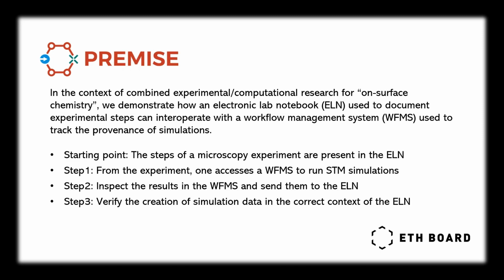In the context of combined experimental research for on-surface chemistry, we demonstrate how an electronic lab notebook used to document experimental steps can interoperate with a workflow management system used to track the provenance of simulations.